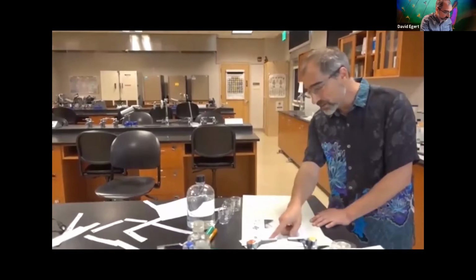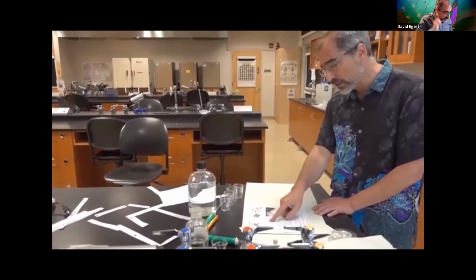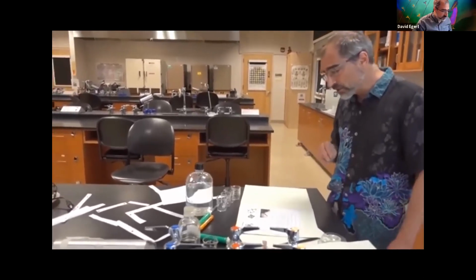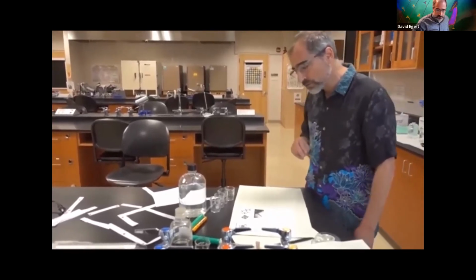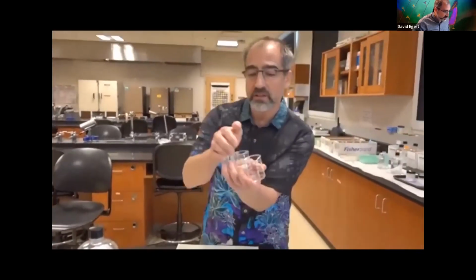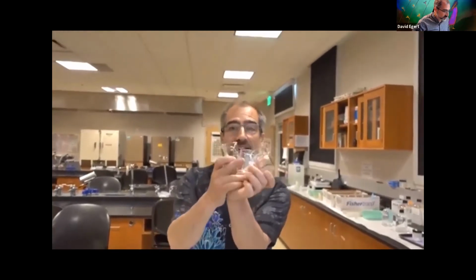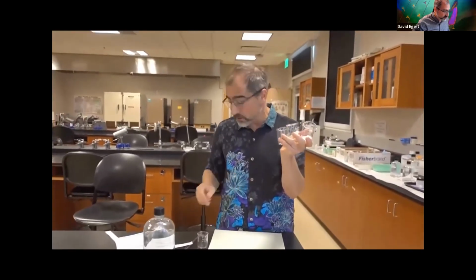So I'm going to say part 1: use a spatula to add small equal amounts, a large pinch, of the dry electrolytes, sodium chloride, potassium chloride, and calcium chloride to 3 separate 50 ml beakers. These are the little 50 ml beakers here. They're very cute. And we're going to put a pinch. A pinch is basically what it sounds like. There's a picture in your lab book showing a little bit. It should be enough that you can actually see it, but not so much that it's not going to dissolve in a little bit of water if it wants to dissolve.